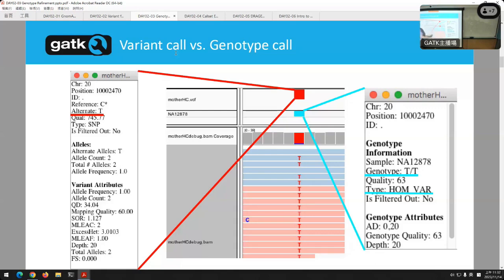So, well, is that heterozygous? Out of 40 reads, if 4 of them are C's and 36 are T's, what is that? Is it heterozygous or homozygous? It should be homozygous, right? Mathematically. But why are there C's? If it's homozygous, why do I see any C's?